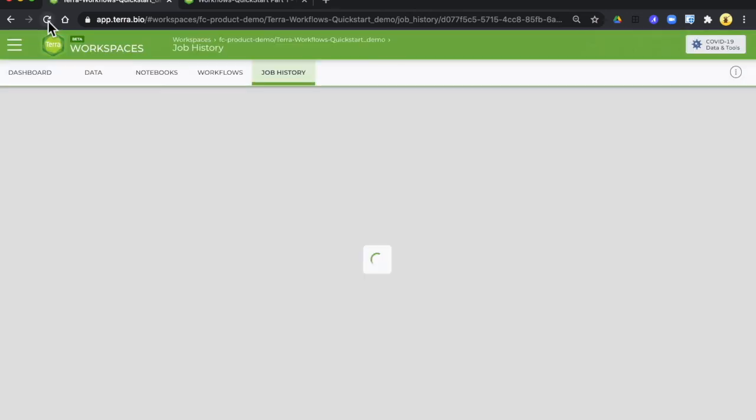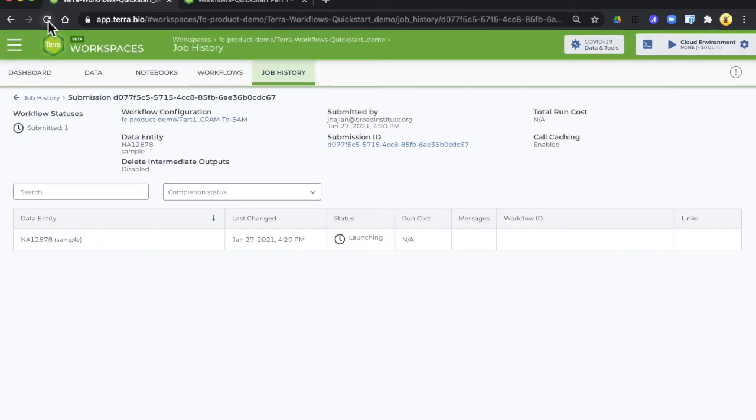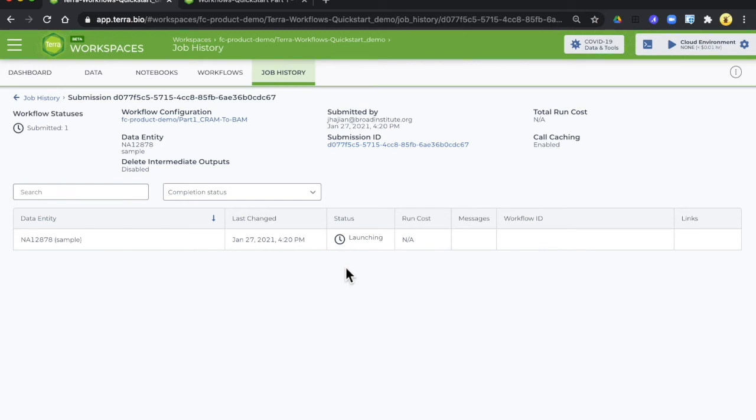You can refresh to see if the status changes. You notice that it's moved to launching now. Some steps take a little bit of time. There's a lot of things going on behind the curtain.